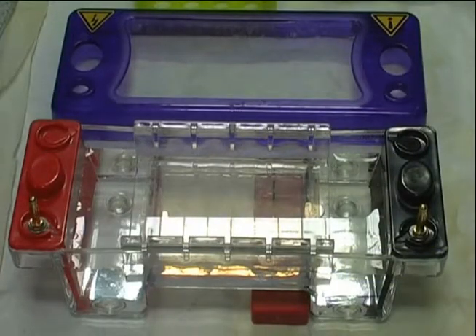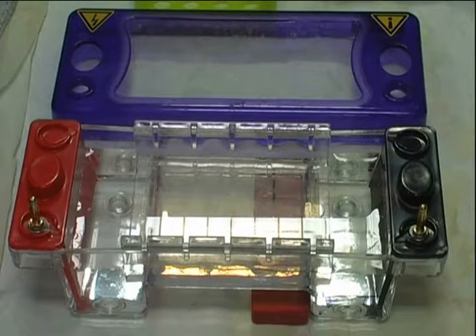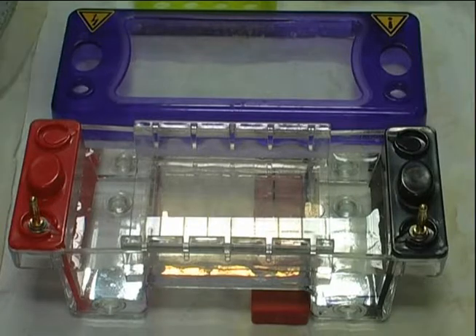Typically, a standard series of DNA fragments of previously known length, called the DNA ladder, is also run with the samples to allow for direct size comparisons.